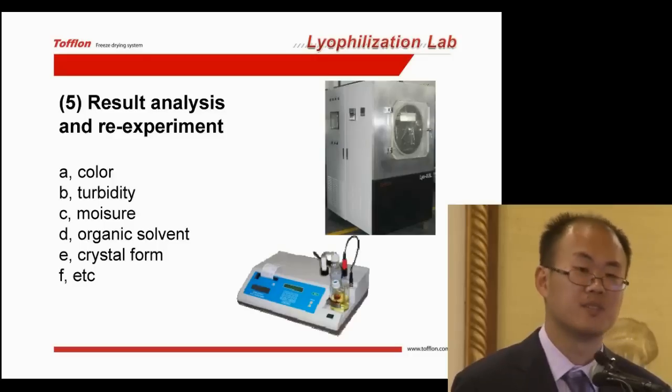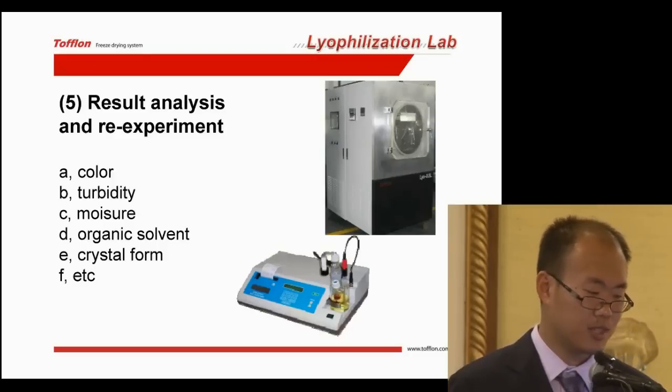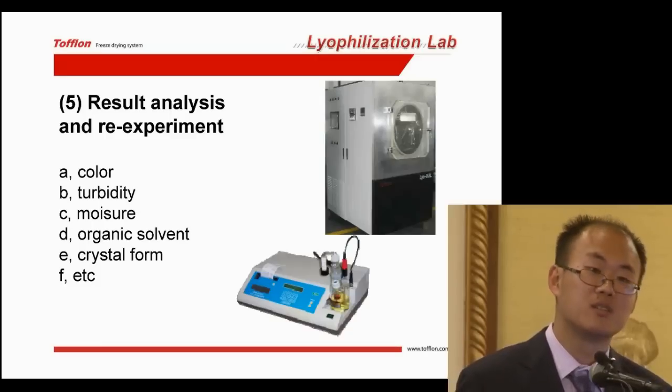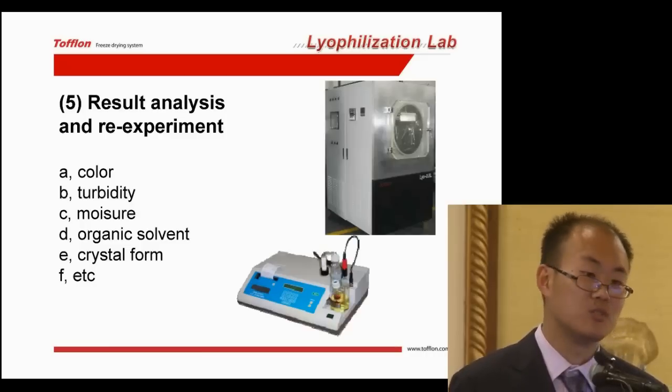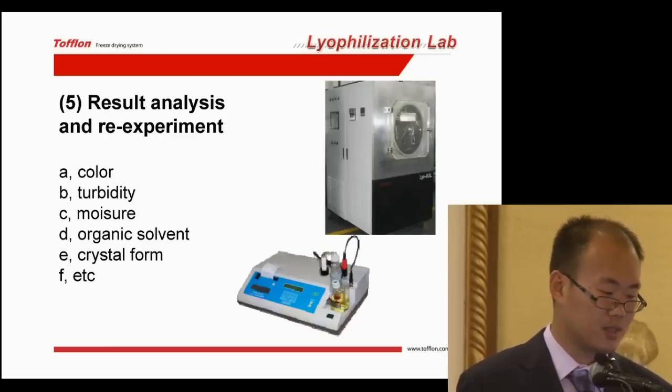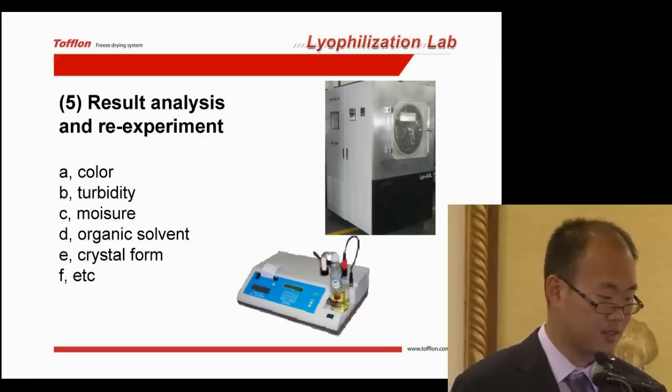For turbidity and moisture: often when you don't perform the right freeze drying cycle, you can't remove the water, so the moisture is often a requirement from the client.